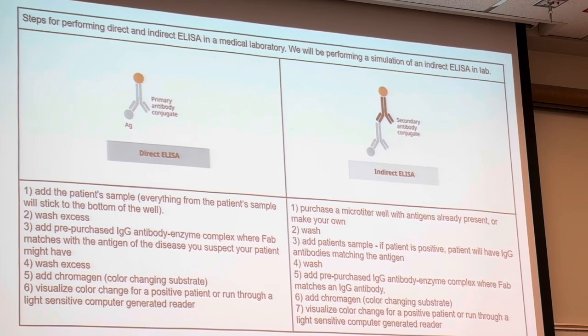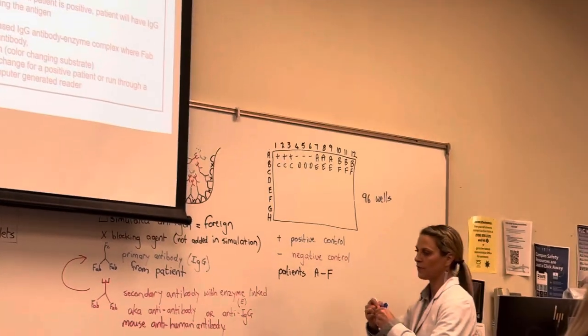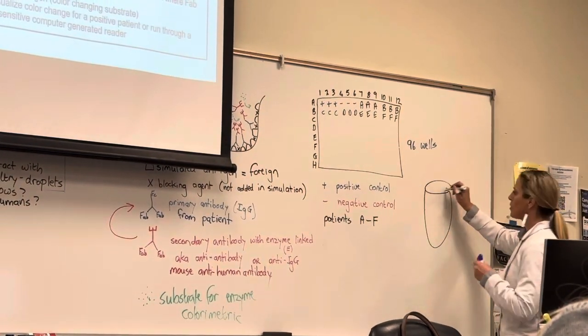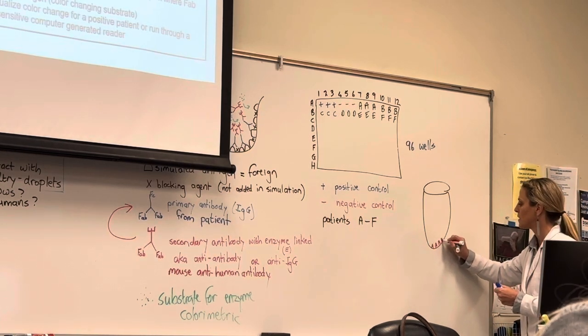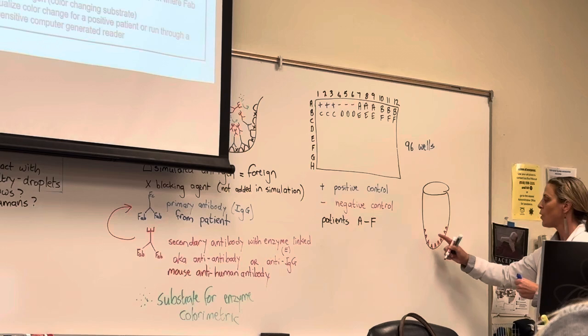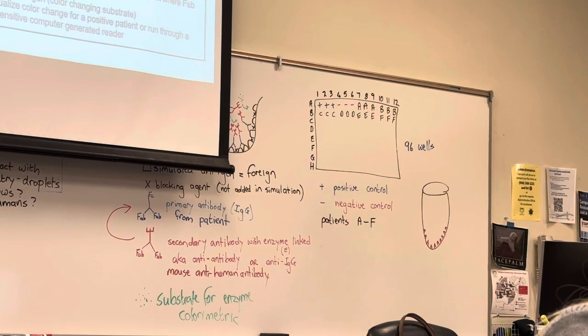And then we're going to purchase an immunoglobulin, an IgG. So here is the foreign antigen. Here's the well. Let me do different colors. I have a cute picture of it, and I'll show you. Here's the well, and here is our patient's antigen that's going to stick to the bottom. If we don't know what our patient has, we can fill thousands of wells, hypothetically, with the patient's antigen. We can fill up tons of them at the same time.